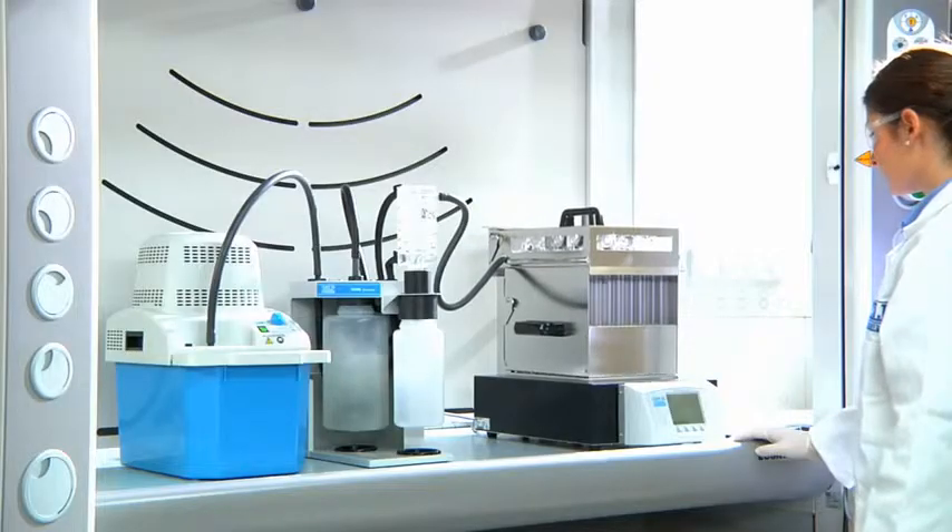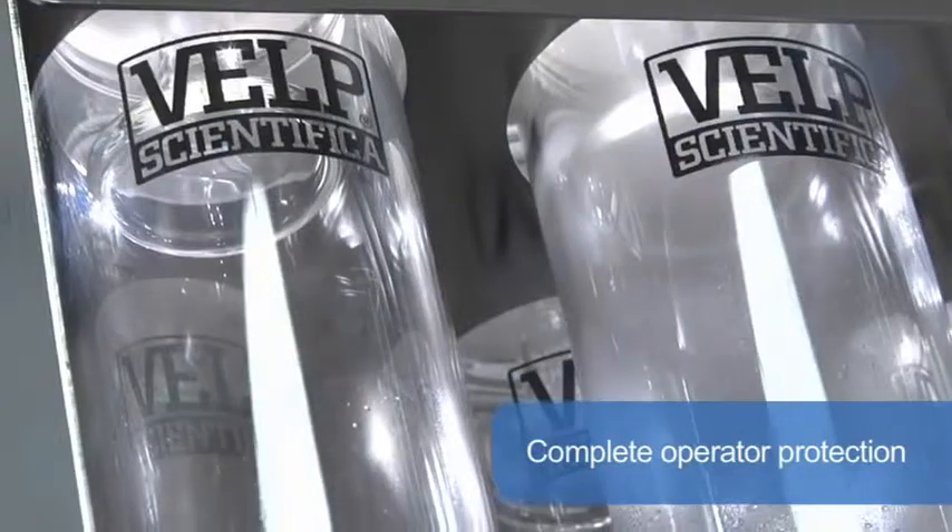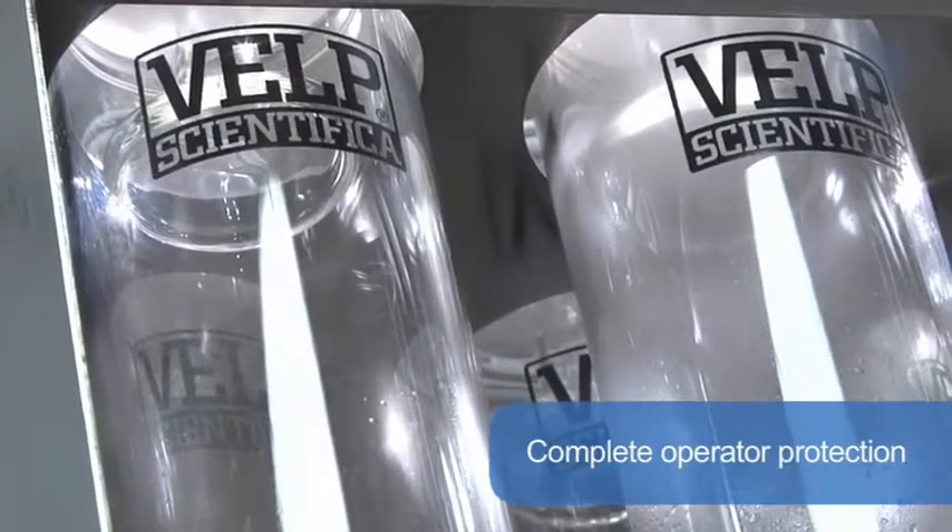Excellent visibility of the samples and any condensed vapors in the manifold gives the operator the best assurance of correct operation. Complete operator protection is ensured by starting aspiration of the vapors as soon as the run starts.